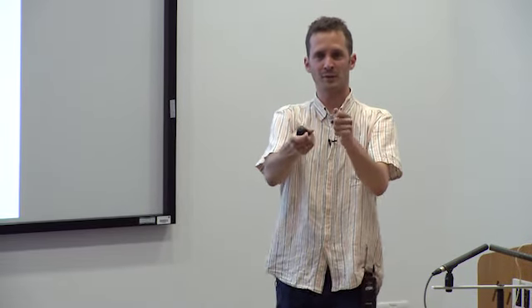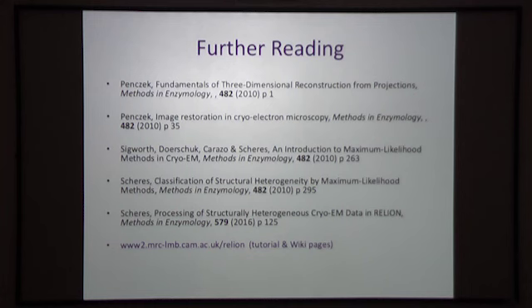And that leads to a formulation where you no longer need to tune all kinds of parameters for low and high pass filters on both the experimental images and the reconstructions, because these get learned automatically from the data for you. And that reduces the amount of user expertise that you need to get the best possible reconstructions out of these programs.